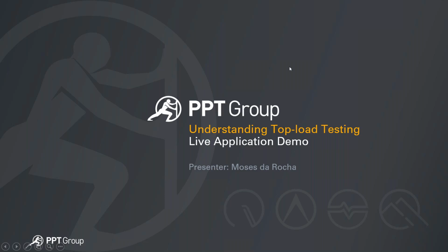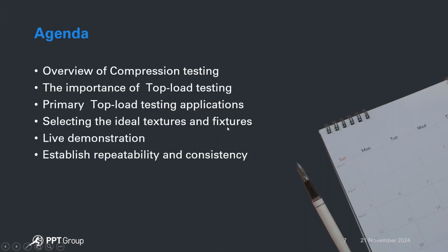Thanks, Lara, and thanks everybody for making our webinar today. So we'll be looking at a few things on top-load testing. I'm hoping to cover as much ground as I can, and the reason for that is usually top-load testing is such a broad topic because of the different types of samples that are available for top-load testing. Today, however, we'll focus more on blow-molded plastic containers because that forms the core or the majority of the top-load samples that are usually tested. But the principle still remains the same, whether you're testing plastics or cardboard, corrugated cardboard, or metals or aluminum, or whatever type of container you need to apply compressive forces to.